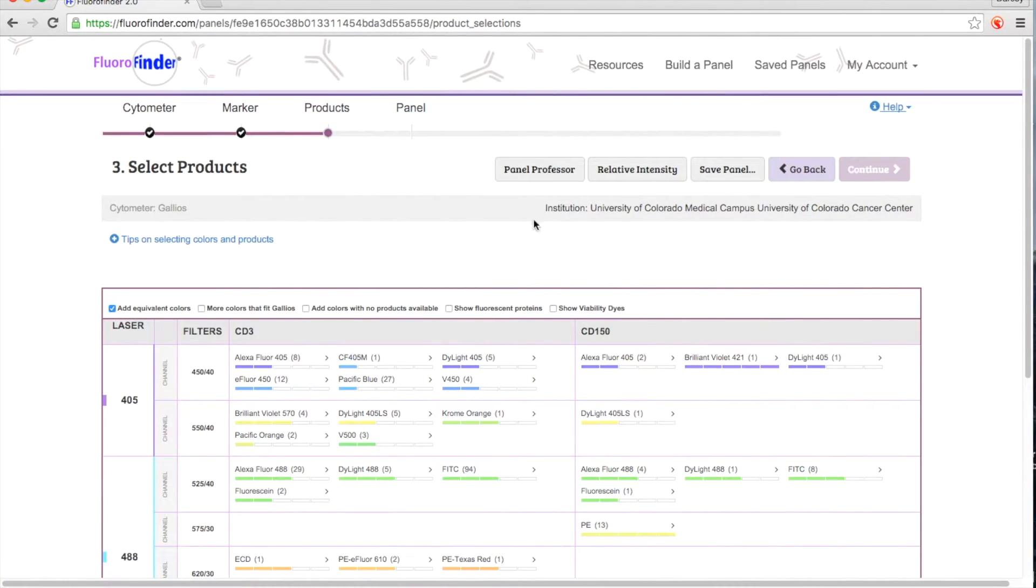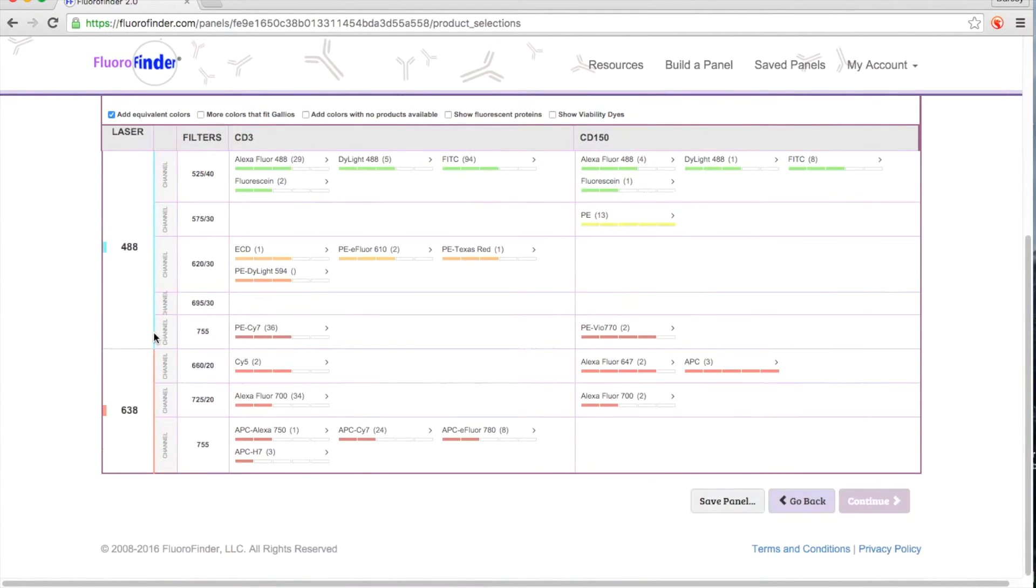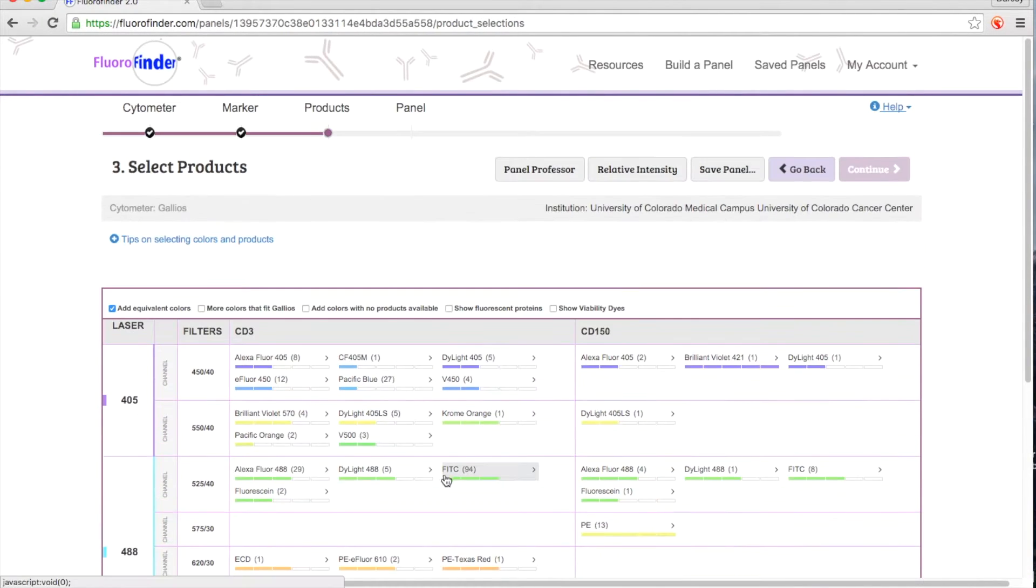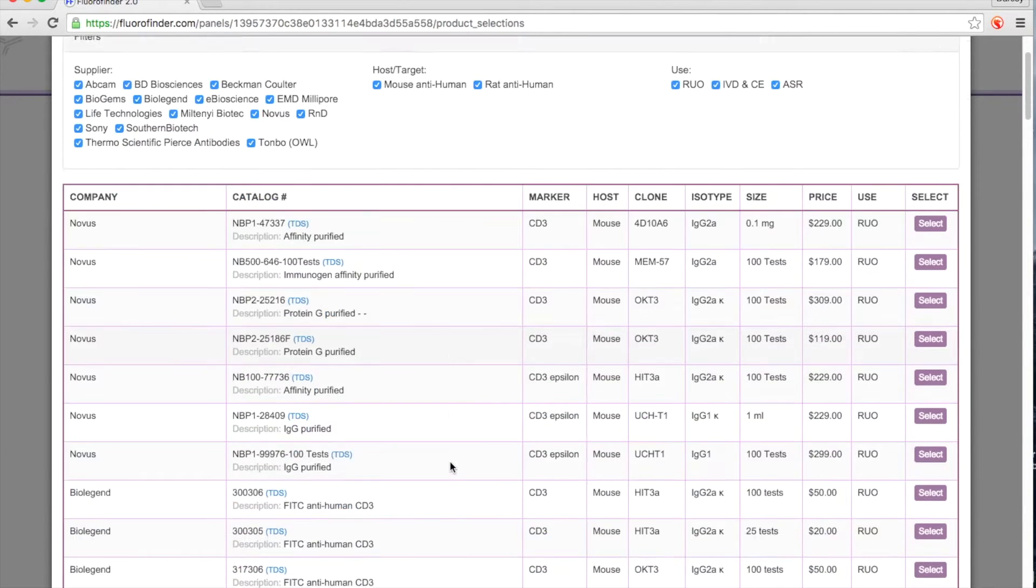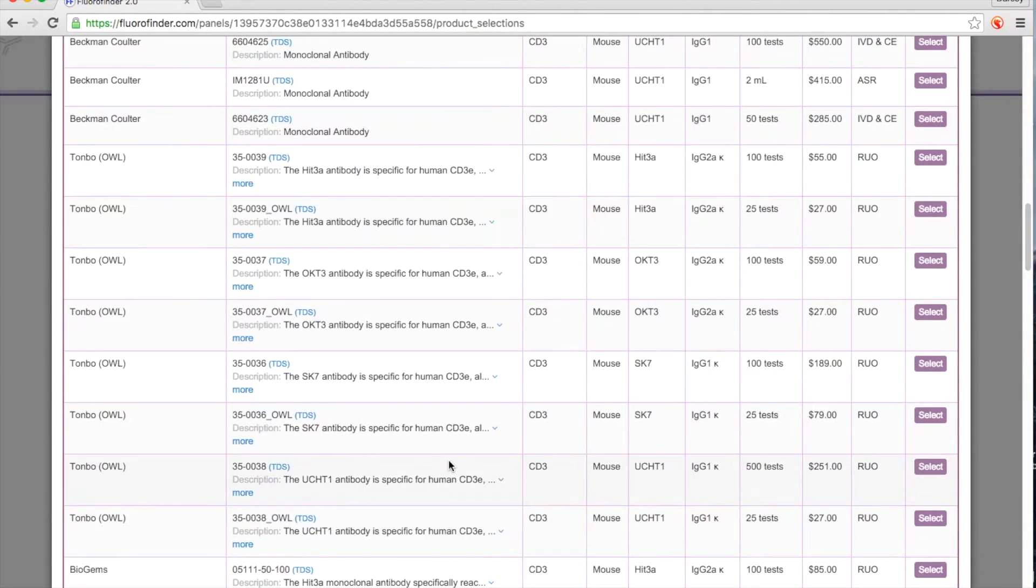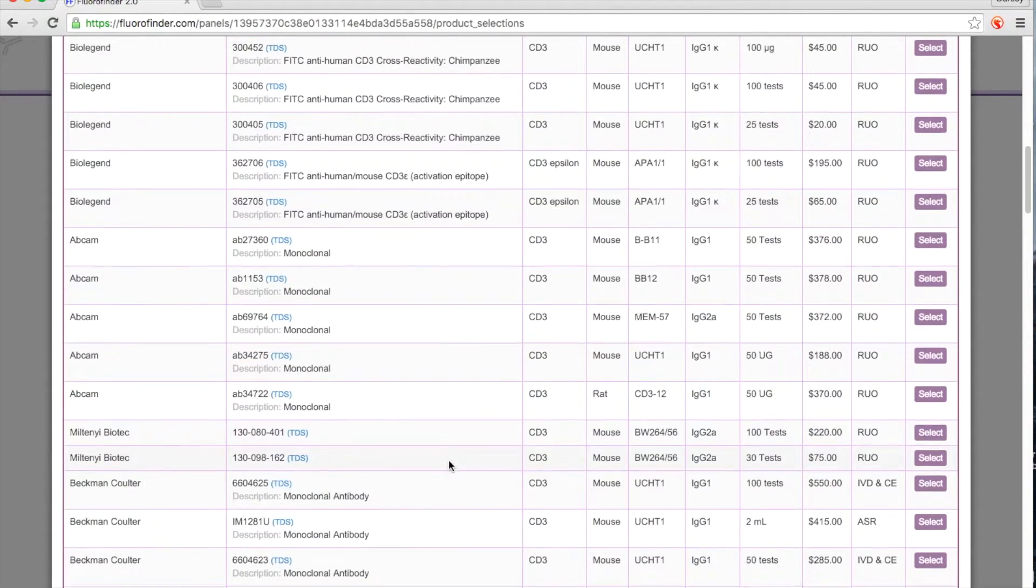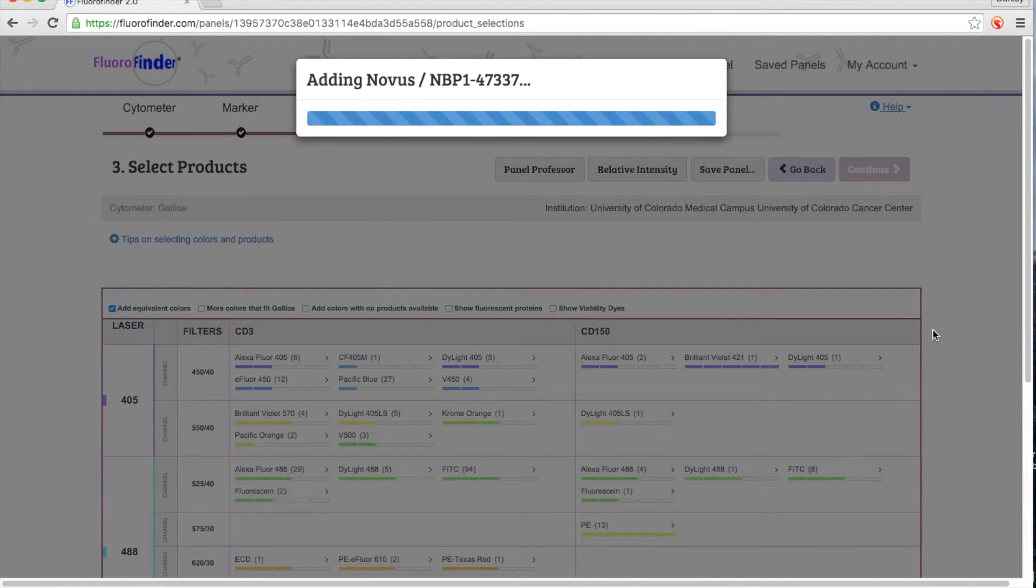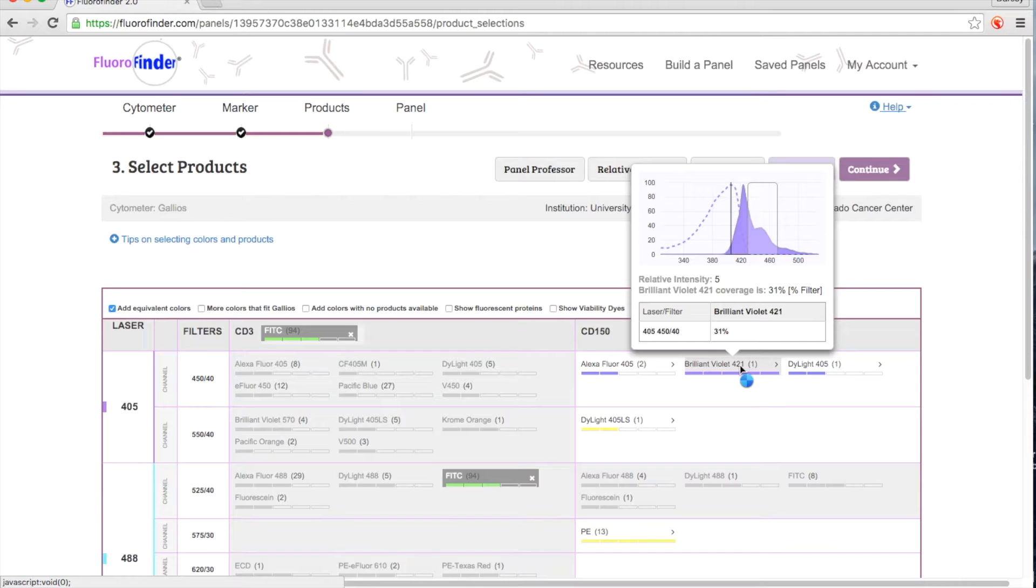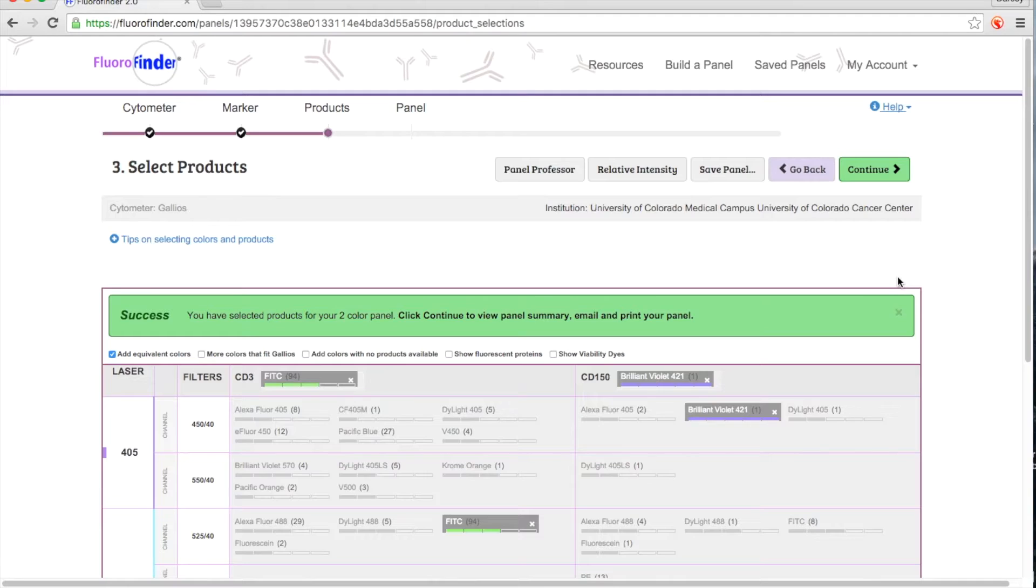The third step merges the instrument configuration in Step 1 with your marker selection in Step 2. Now you can choose from our extensive list of available antibodies and functional dyes that will work on your cytometer. We also have a lot of intelligence baked into our system to keep you from picking products in the same detector and to help minimize spillover.